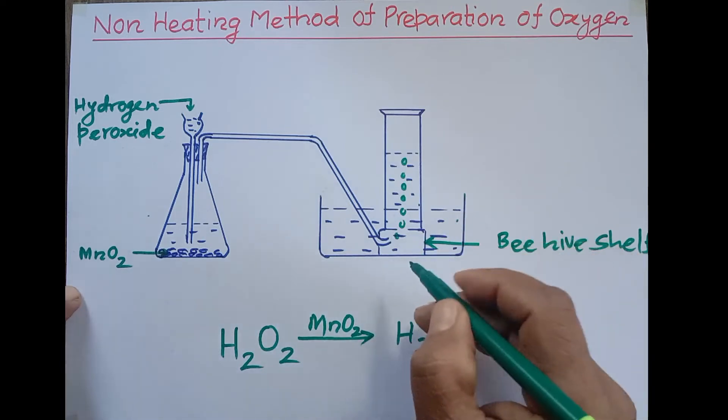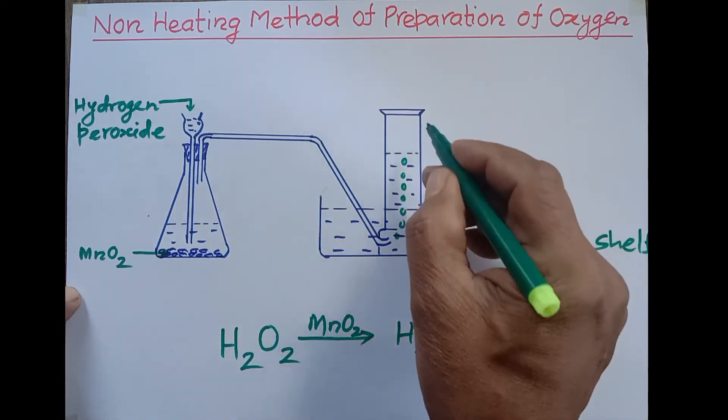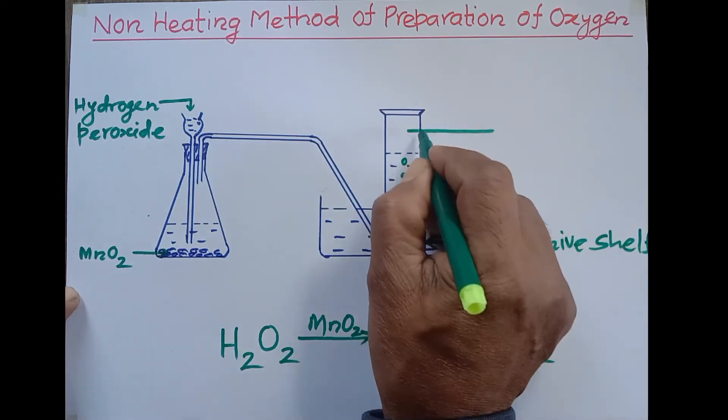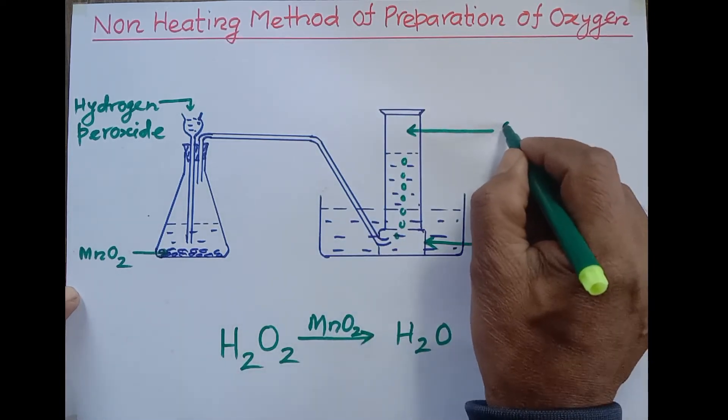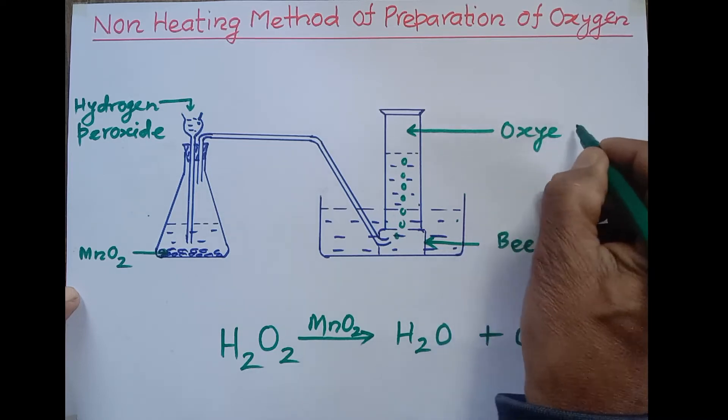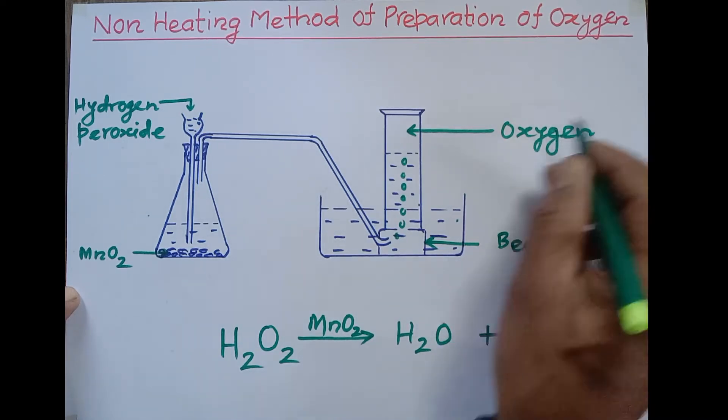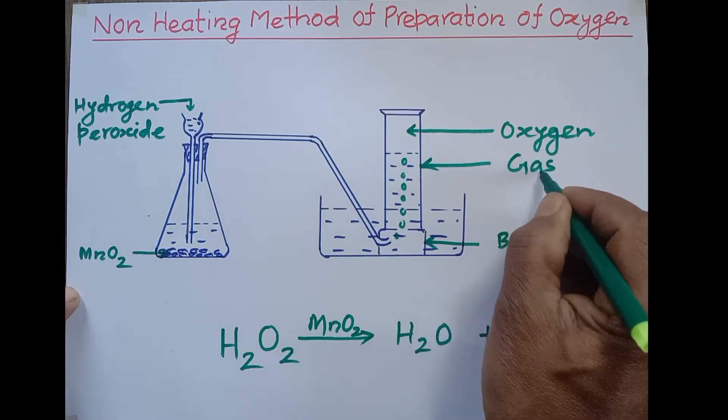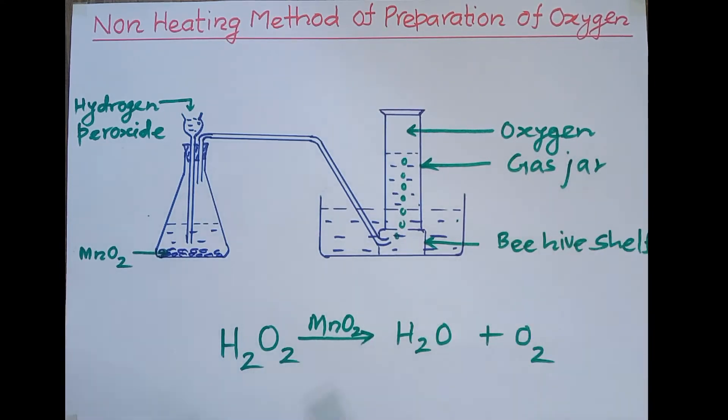Because oxygen's solubility is negligible in water and it is lighter than water, it displaces water in the downward direction and begins to collect at the top of this gas jar. This is where the oxygen gas is being collected. This is the gas jar and this is the method of preparation of oxygen gas without heating. This is not a dangerous method.